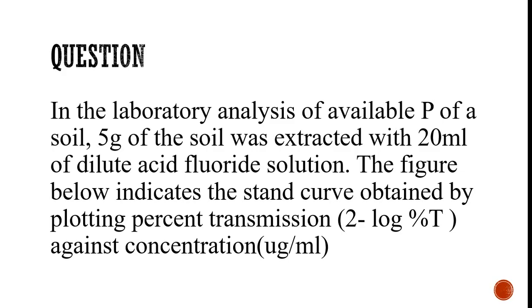Welcome to this video. In this video, we are going to study phosphorus analysis, one of the analyses done to determine the available phosphorus in the soil. The reason for doing this analysis is to determine the amount of phosphorus in the soil and how much to supplement for plants. If the phosphorus available in the soil is so low that it won't help the growth of plants, then we have to add more through the application of fertilizer, phosphate fertilizers and the like.